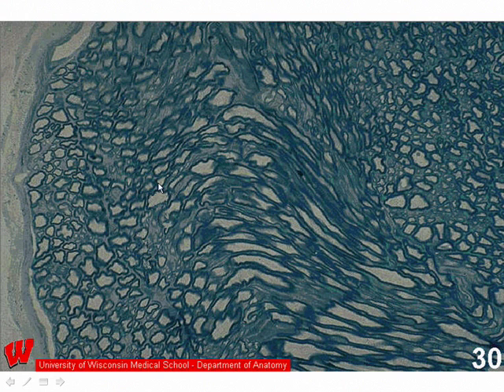This is a very large nerve, such as the sciatic nerve in the back of your thigh. As you go across the nerve in cross section, you see many, many myelinated axons, the myelin being this dark staining substance.